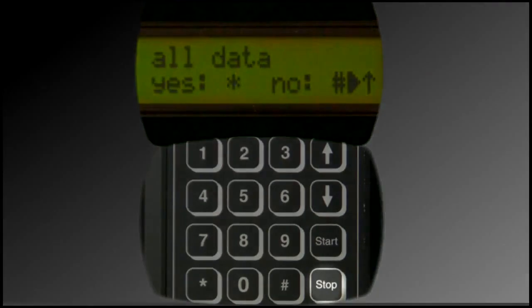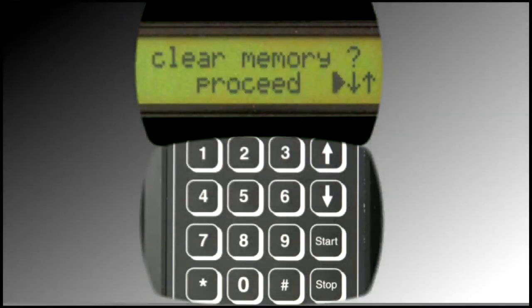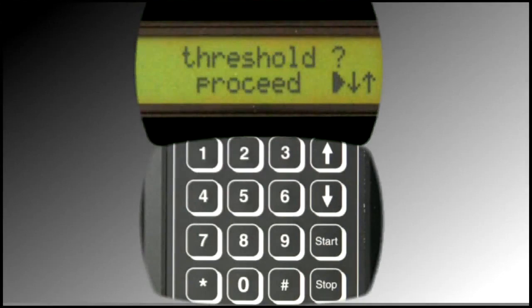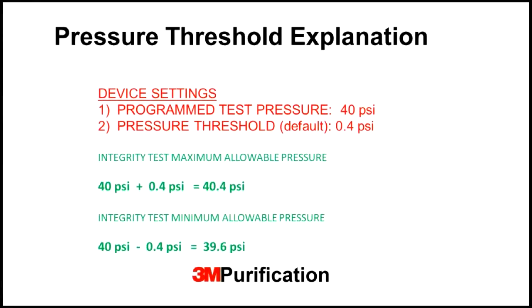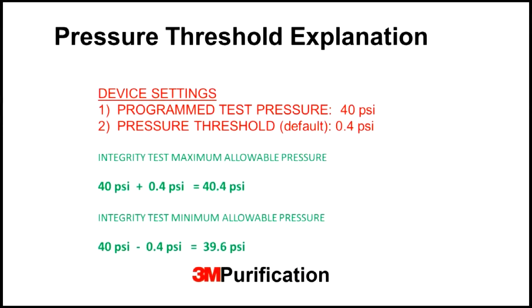If neither option is desired, press the Stop button to return to the prior menu. Press the Up arrow. This is where the Threshold Pressure setting can be adjusted. The Pressure Threshold is the range of pressure that must be adhered to once an integrity test begins. There is a lower and upper threshold value programmed in the device. The default value for both is 0.4 PSI. For example, if the programmed test pressure is 40 PSI and the pressure threshold is set to the default value of 0.4 PSI, then the device would allow for the test pressure to vary from 39.6 PSI to 40.4 PSI once the integrity test began. Failure to remain within this pressure range would yield a false result.